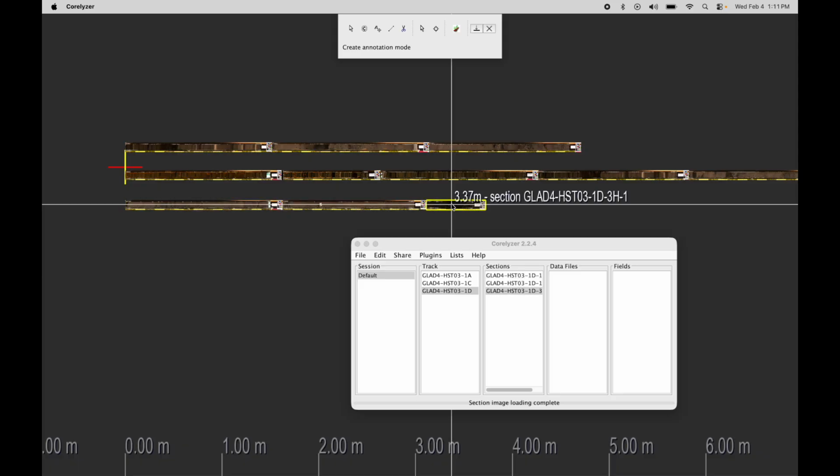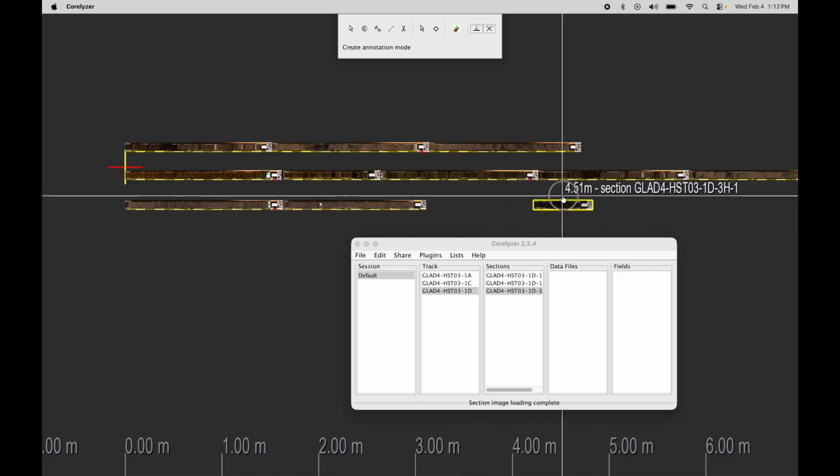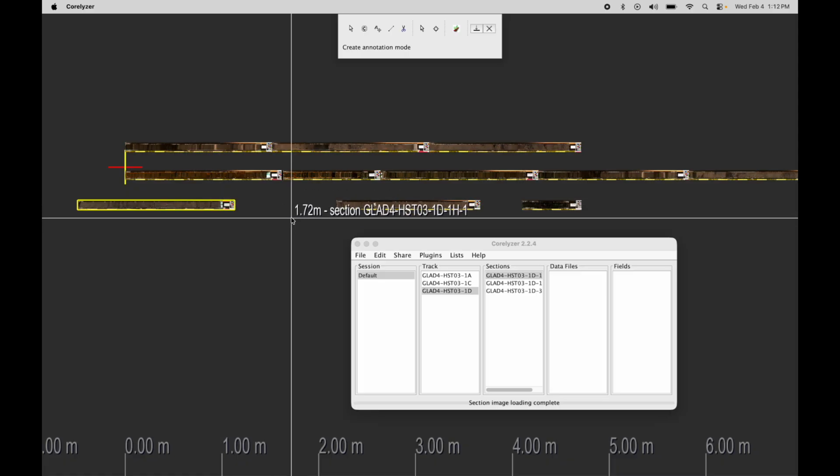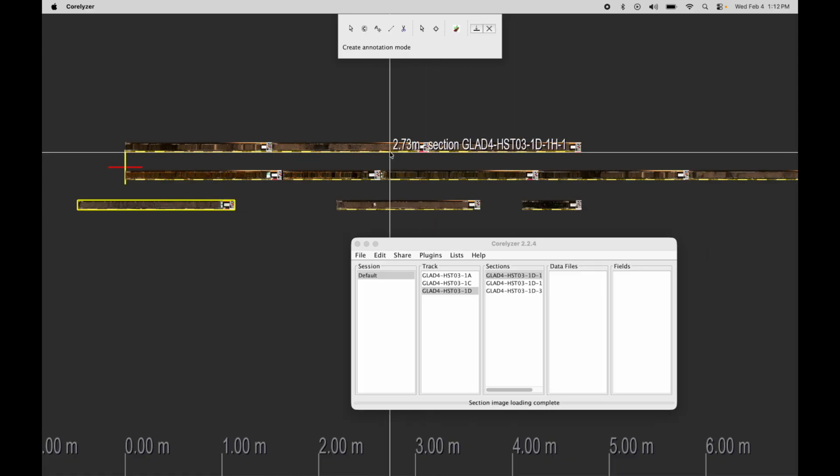And you do that by holding, on Mac, the Option key. On Windows, it's the Alt key. And then similarly to dragging tracks, I'm holding down that button, and now I'm dragging along the depth axis. So now I'm adjusting the position of this core on the depth axis. I can go any direction I want. And this selection does apply here.